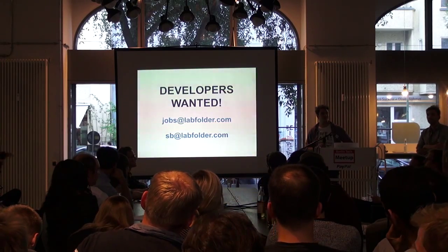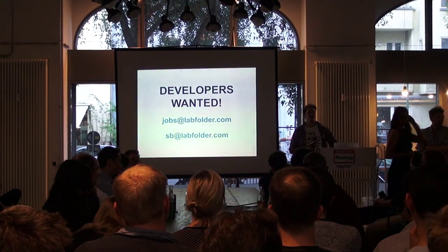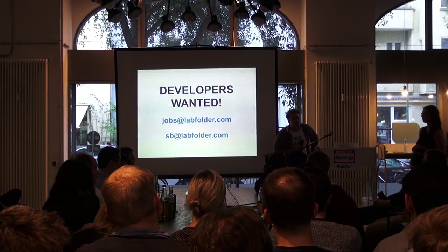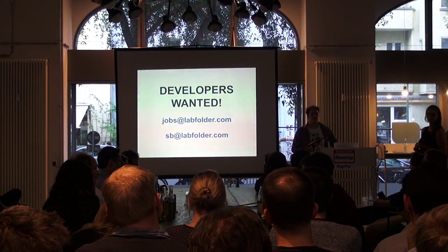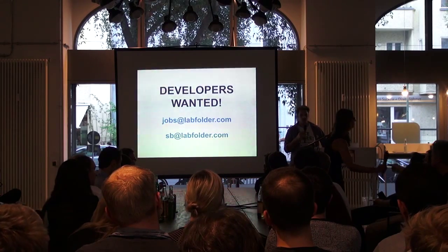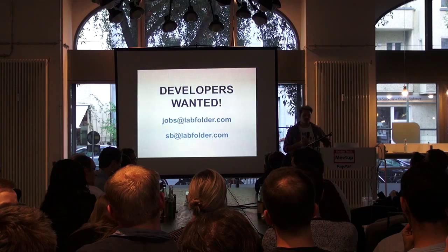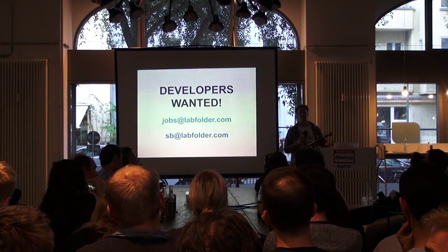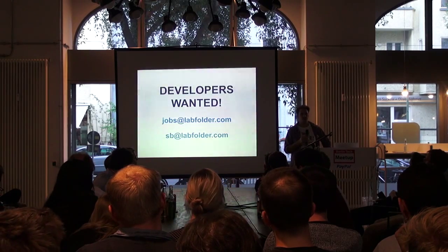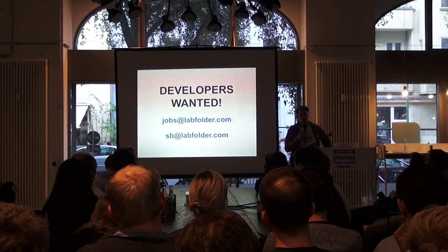Questions? You see the clients for you as buying this and setting up their own servers within their own intranets? Say again? You see your clients as being people who buy this for their labs and set it up within their own intranet? Exactly. So we see both. We see people that use the cloud, but also people that set it up in their own intranet. For 2 reasons. First, of course, is data security, because it's very valuable related data. But also it's an economical reason, because sometimes you have just raw data that is like terabytes, and you don't want to upload this in the cloud because it just takes too long.